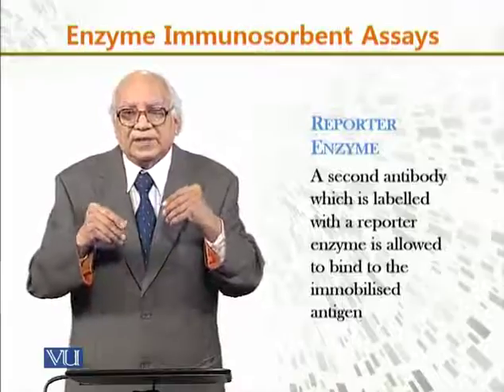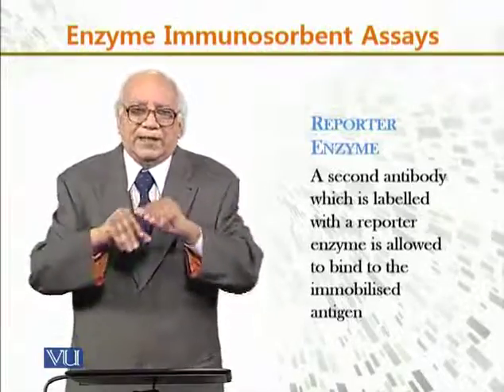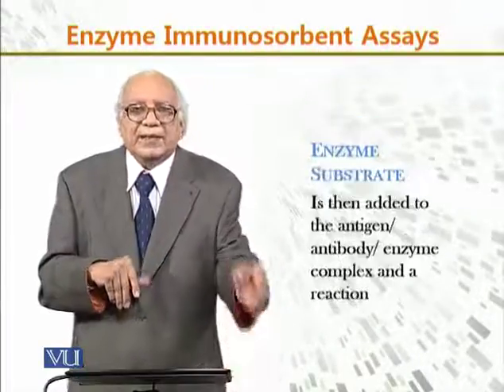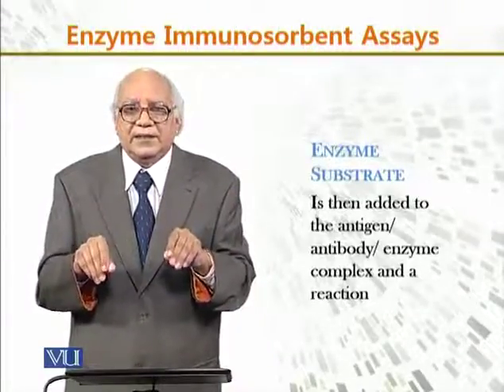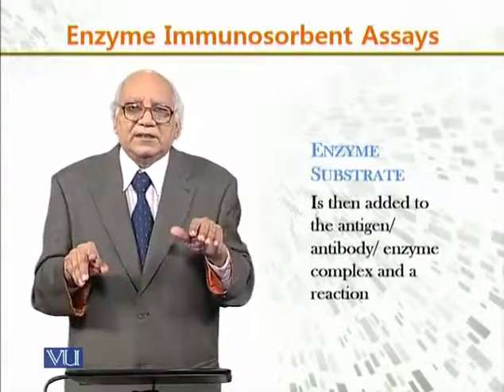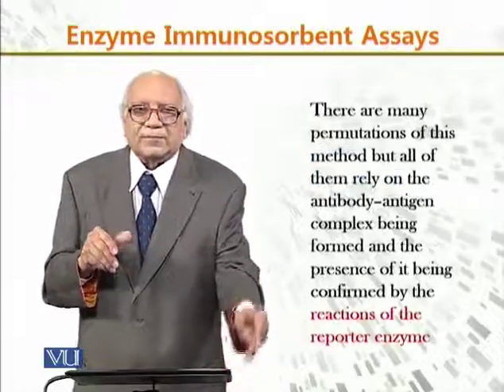The enzyme substrate is then added to the antigen-antibody-enzyme complex on our solid plate, and a reaction occurs.